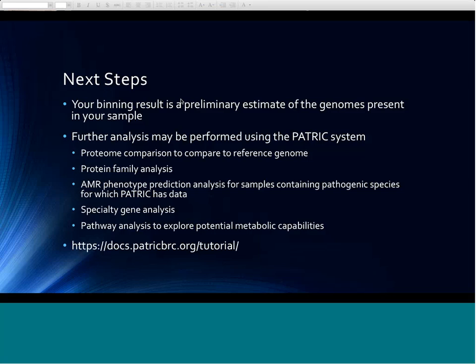One is if you have the standard FASTA ID that includes the coverage information in it and the length. We'll also look for a coverage equals keyword in the comments of the ID, and I cannot remember now which keyword we look for.